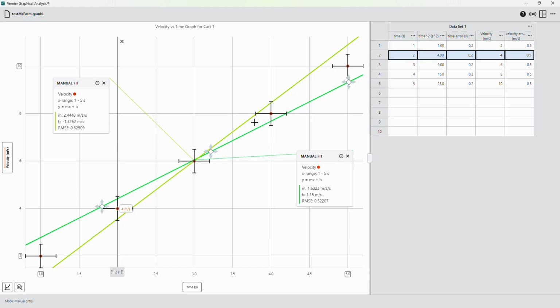Yes, okay, I'm happy with this. So I have my maximum as 2.4 and I have my minimum at 1.6, okay? So I repeat, this is very important for our experiments.